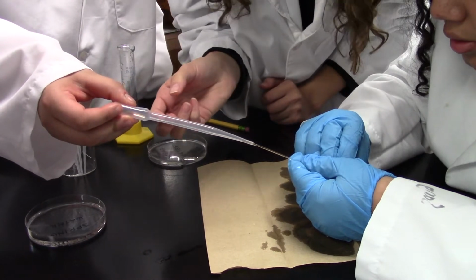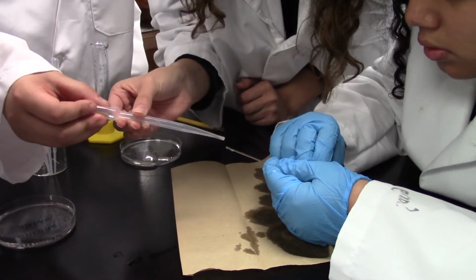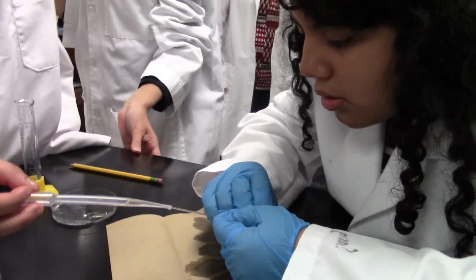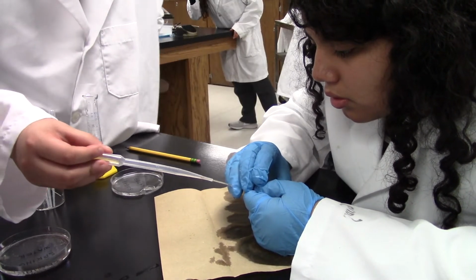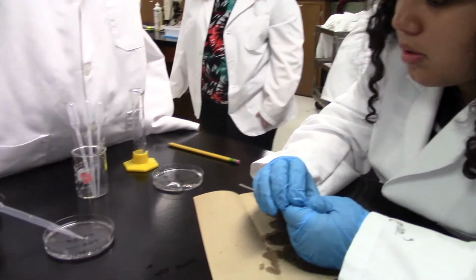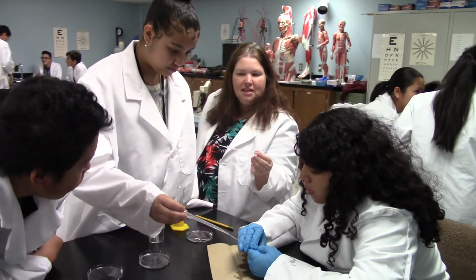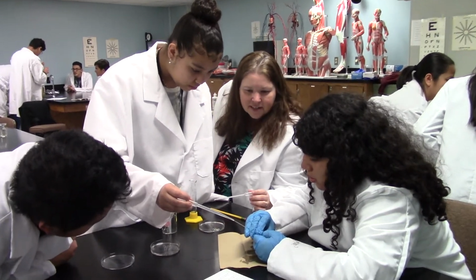Oh, it's going on the side again. On the side again? Okay, there it goes. Give the worm more water. Yeah, come on. We're like waterboarding him. It's going on the side again. Yeah, it is. There's no time, so just get one. Sometimes it's good to suck them up when you're trying to put them in the capillary tube with the thinner one. But you could try it. And using gravity. Did it go? No, they keep on going to the side.